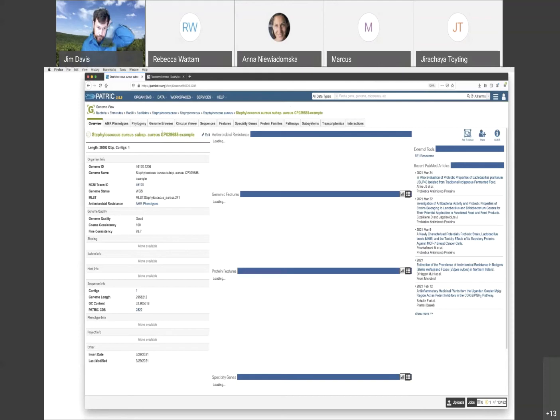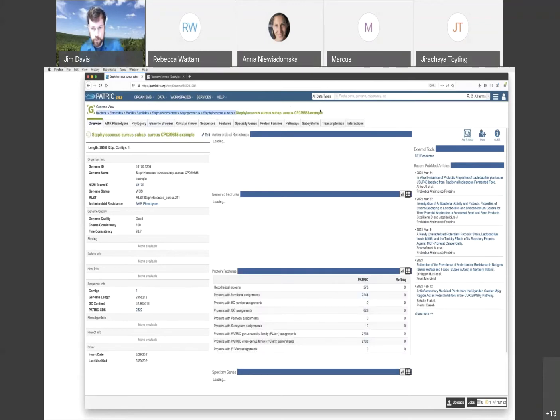It would have shown up in the genome browser as a private genome, but I ruined that by annotating it into the public workspace directory. As a result it couldn't see it, but it did get indexed against the Solr database.